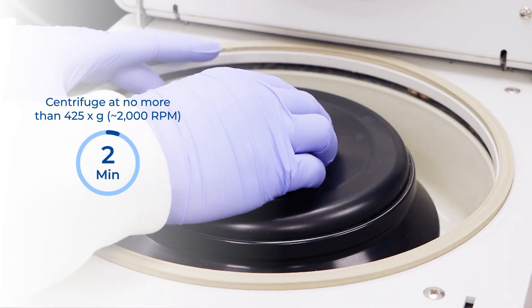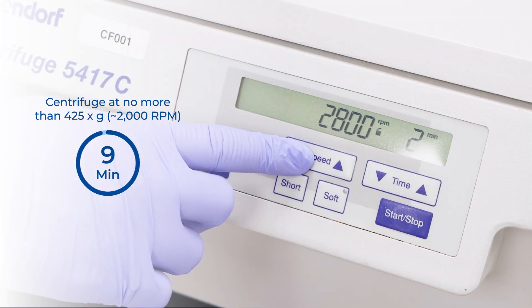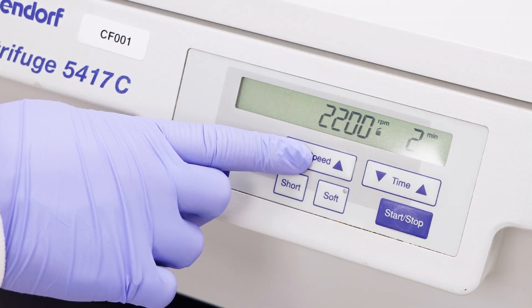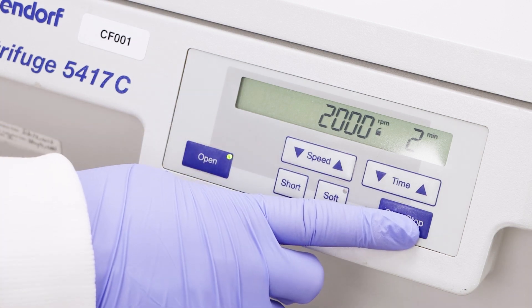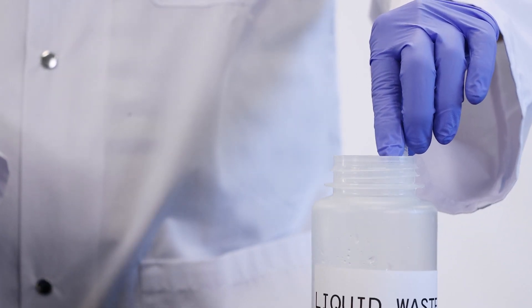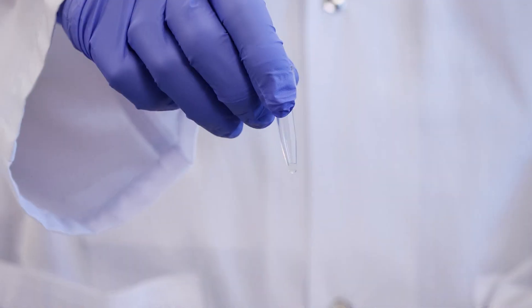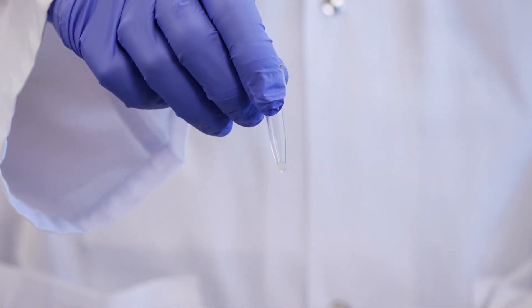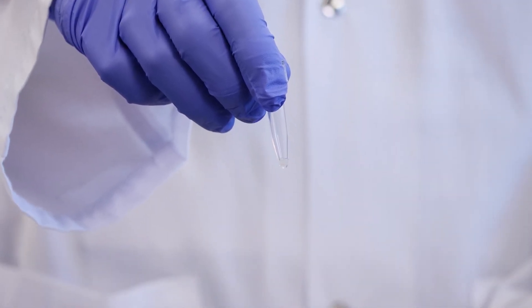And centrifuge at no more than 425g or 2000rpm for 10 minutes to pellet cells. Carefully decant the supernatant. A few microliters of media may be left behind with the pellet in order to ensure that the pellet is not dislodged.